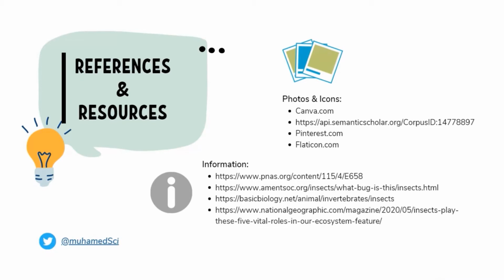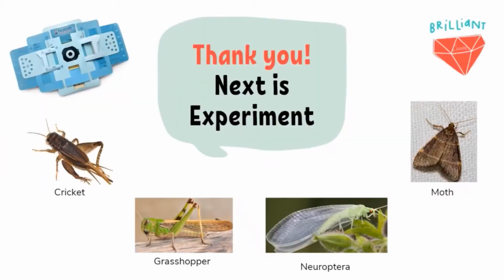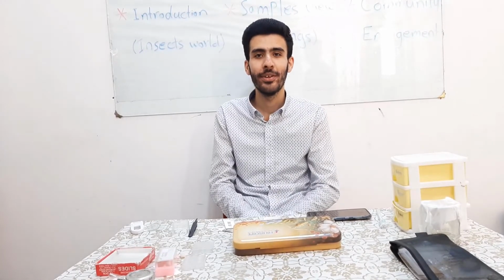For now, we are at the end of our first part, and now we are going to move to the experiment, and we will get to see these insects, as you see in these pictures, under the Foldscope. We are going to prepare the slides and see how they look. Okay, so now it's experiment time.